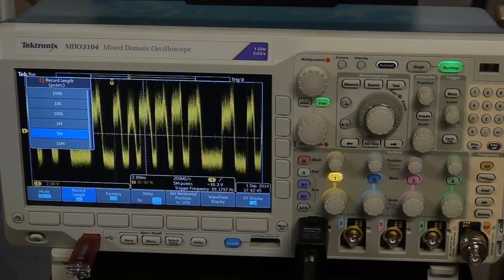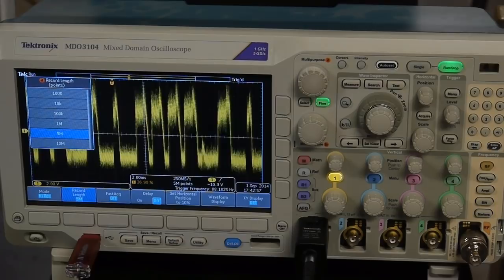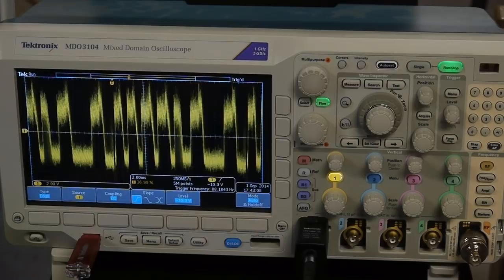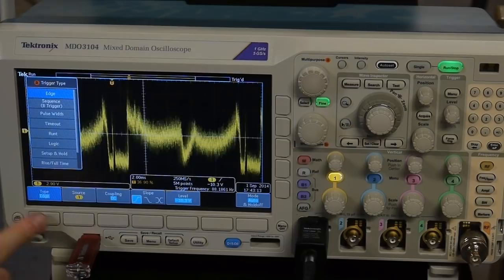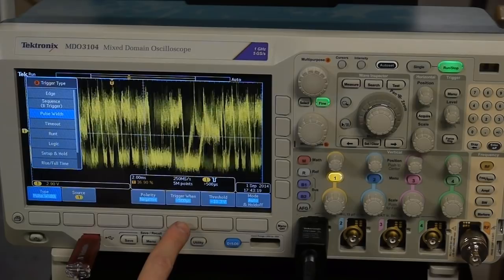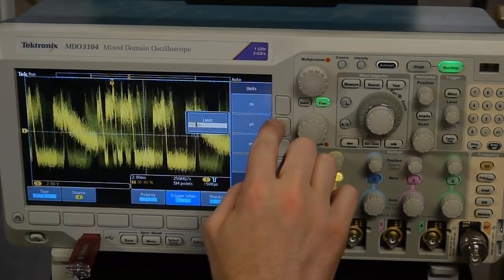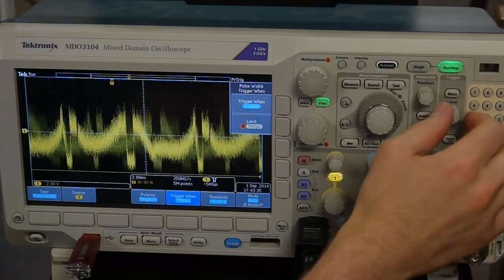Right now the scope is just triggering on every horizontal sync pulse that it gets. However, a slightly more elegant way of doing it is to set up the trigger so that it will only trigger on the vertical sync pulses, so that when the scanning electron microscope starts a scan, the scope will be triggered and will have the data at the right point. So instead of a simple edge trigger, I'm going to set up a pulse width trigger, and we are going to trigger when the pulse is greater than 500 microseconds.